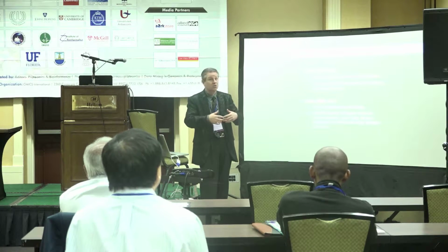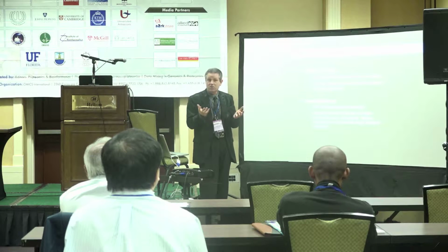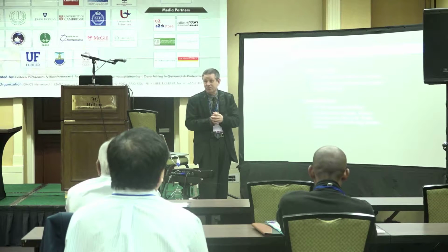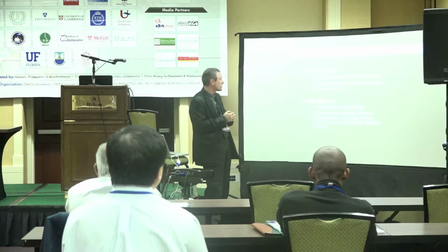So now you can see, well, is that increase in signal because the total amount of the protein has gone up, but the stoichiometry hasn't changed? Or is it because the level of the protein's unchanged and the stoichiometry has increased? This is always a problem, especially if you're doing studies like mass spec, for example, when you see increased phosphorylation. Is that because the protein changed, or is it because the phosphorylation of the protein is altered? So we can address that now.